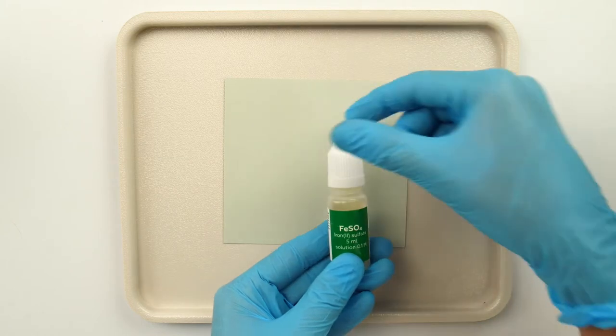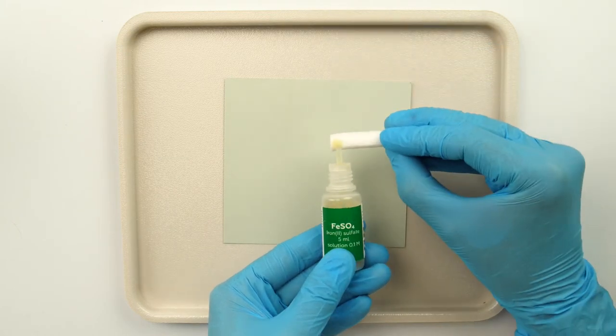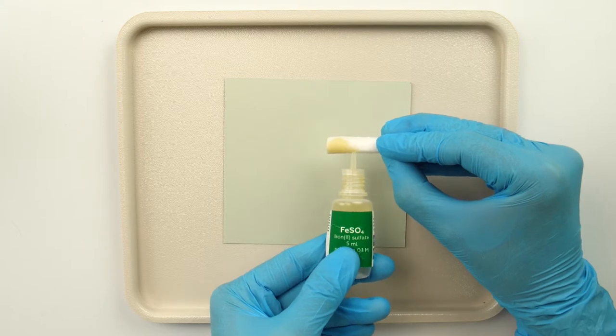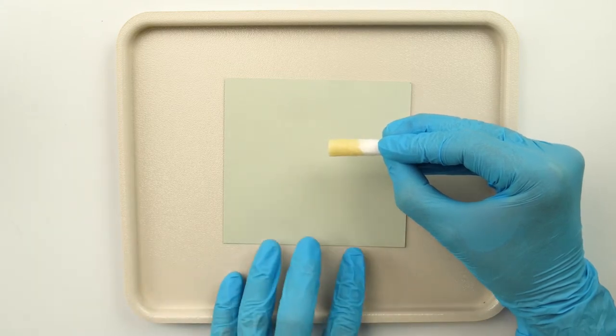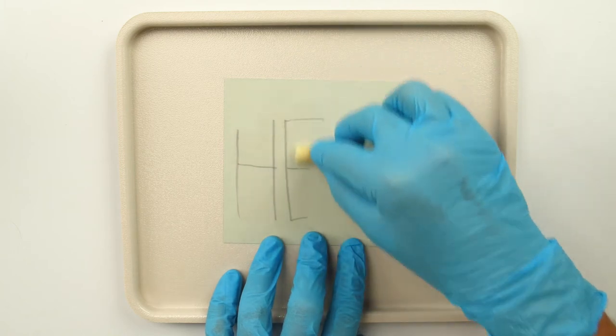Reveal the secret message. Moisten your cotton absorbent with iron sulfate and rub the absorbent on the piece of paper. Now you can read your secret message.